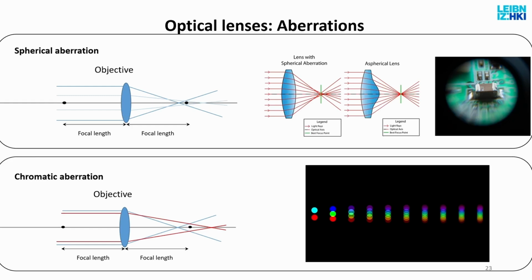First of all, spherical aberration. When I told you how to draw the formation of an image, and I said a light beam that comes parallel with the optical axis will be focused from the focal point, that is obviously not true, because the farther you are from the center of the lens, the higher the angle at which the parallel beam will hit the surface.